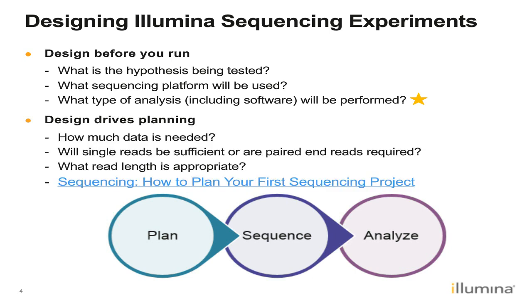So once you've completed your design, this is going to drive your planning. So questions like how much data is needed is going to be very important. How much data kind of spans, it's a very big question. Are you looking for low frequency variants, in which case you might need a lot more data than, say, your typical whole genome type of experiment.